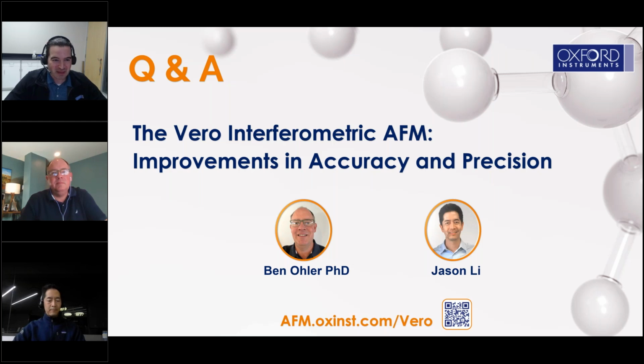Thank you. So a question for Jason. Does the improved sensitivity of QPDI eliminate the need for PFM amplification techniques like DART and high voltage biases? At least certainly for the samples that we've looked at, you don't need to be on resonance or use high voltage to be able to see the signals. Simply with QPDI's noise floor, we're able to see those low response signals.